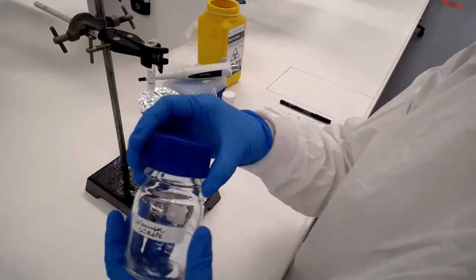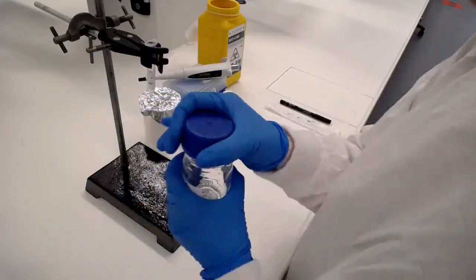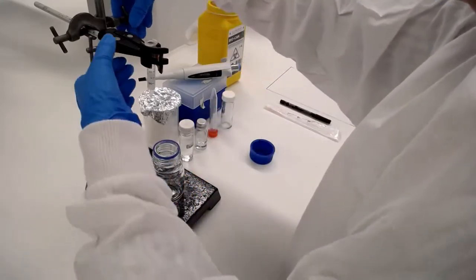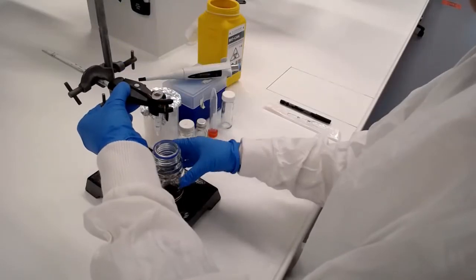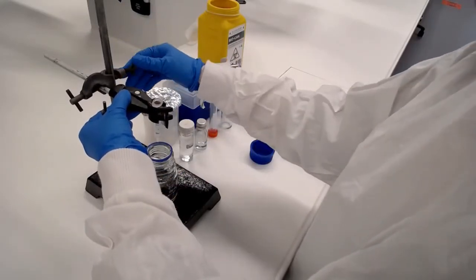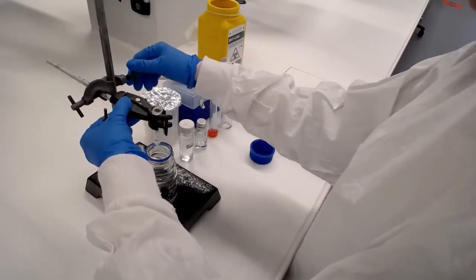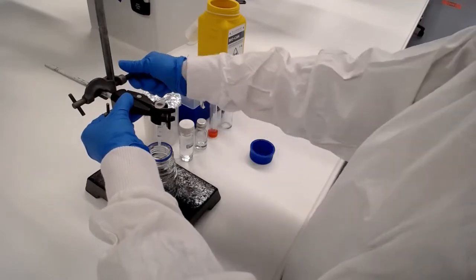We've attached it to the little clamp on the retort stand and we're just going to lower this so that it's just above our column waste bottle. Very important to put that column waste there or else we're going to make a big mess. Make sure that waste bottle is centered under the column.